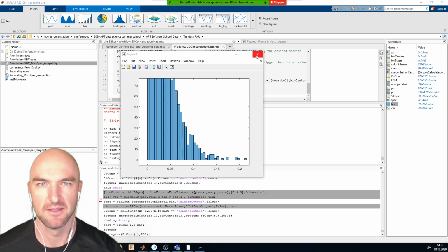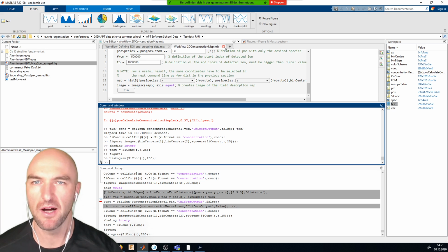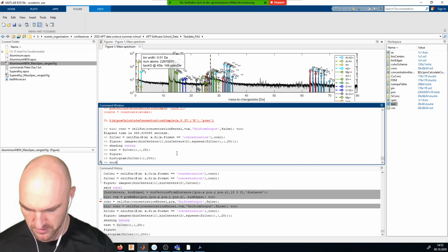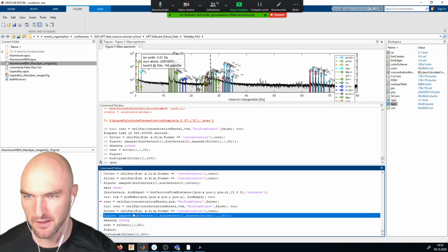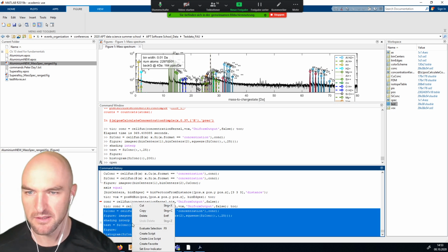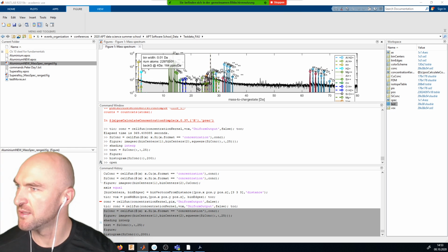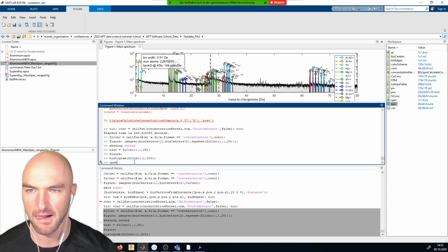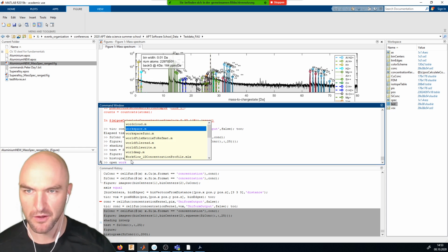But let's just give it a try. And now I will actually open the workflow. Sorry, and I'll copy all of that other stuff for you as well.